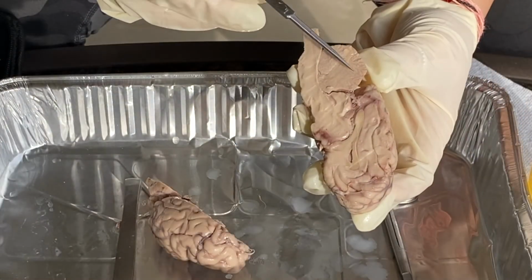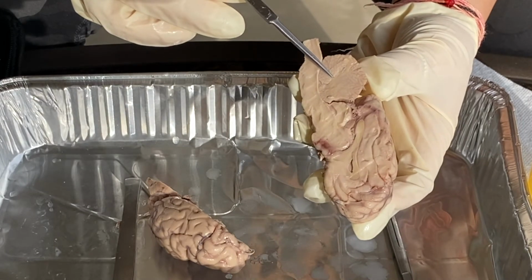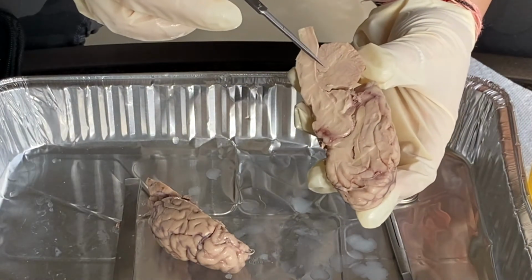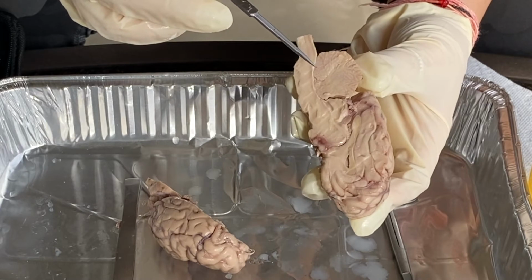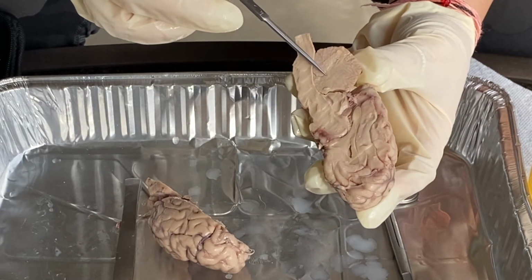White veins that are part of the cerebellum are called the arbor vitae, which are also known as the tree of life, because they function in bringing sensory and motor information to and from the cerebellum.